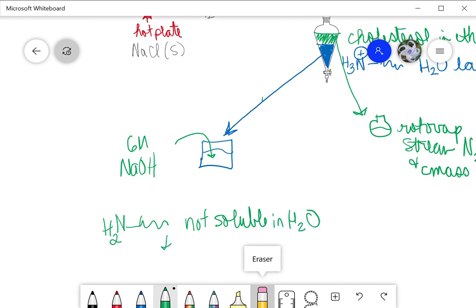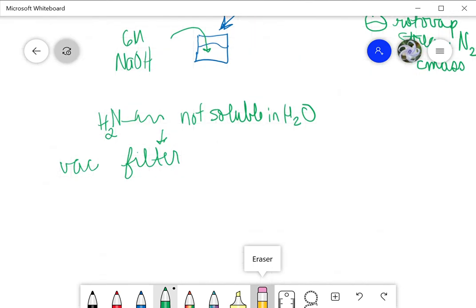You're going to do what we call filter, and we're going to use a vacuum filtration.